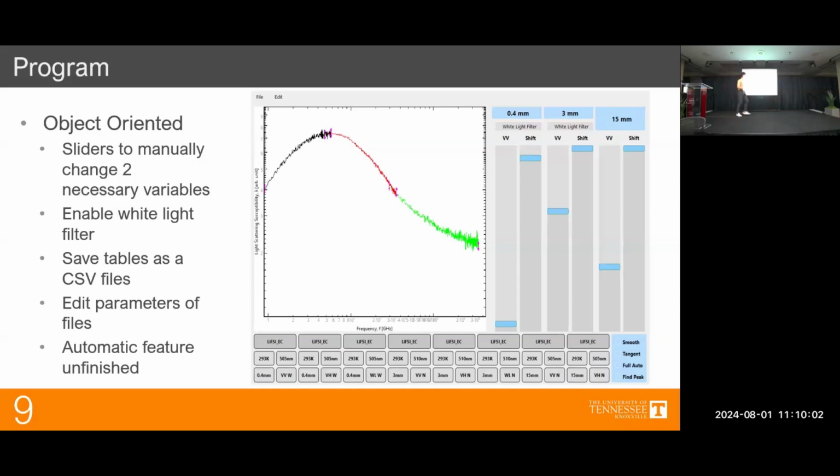So just breaking this down. First off, the variables, as I described before, you can just slide them using a slider to shift the graph. You can also turn the filters on or off depending on the actual sample itself. It describes to you the sample and the different data. There's a total of 8 samples you'll take during the acquisition, and it describes those as well.